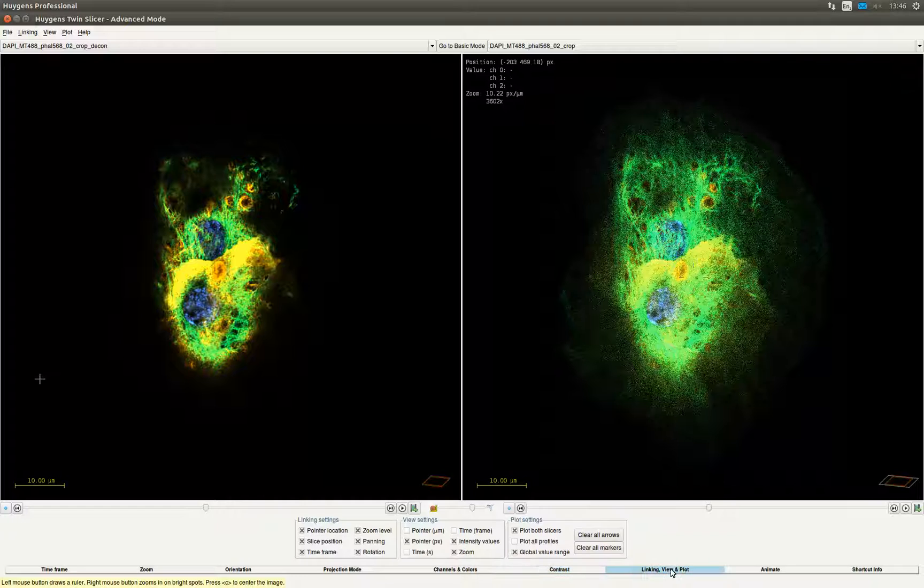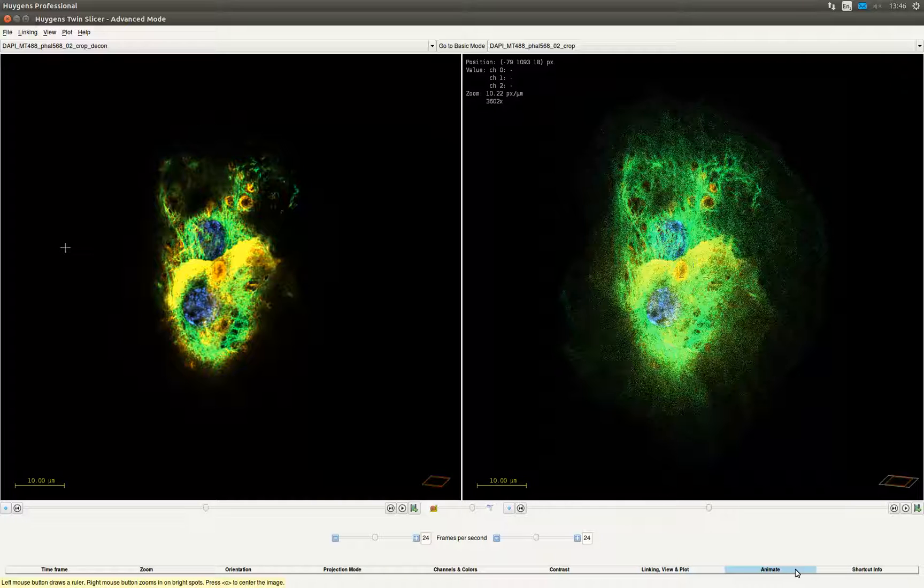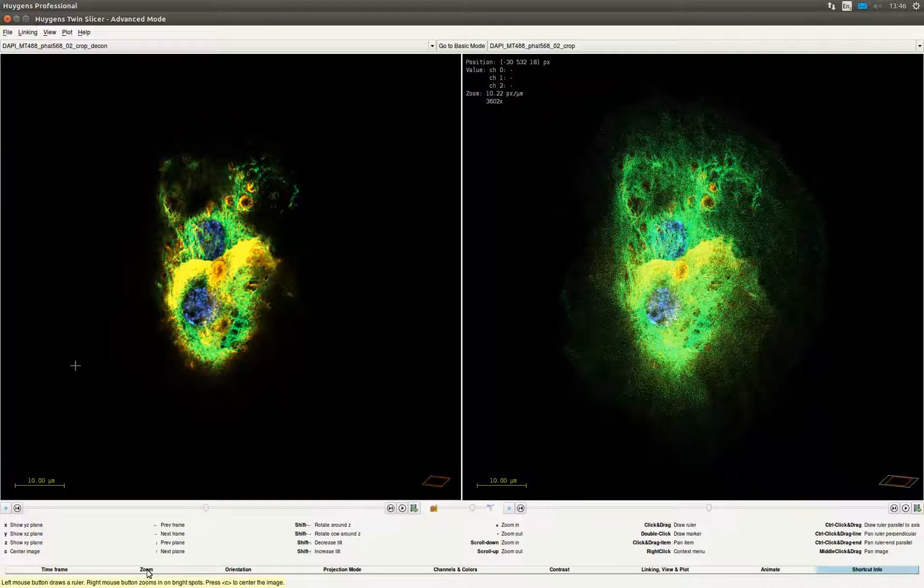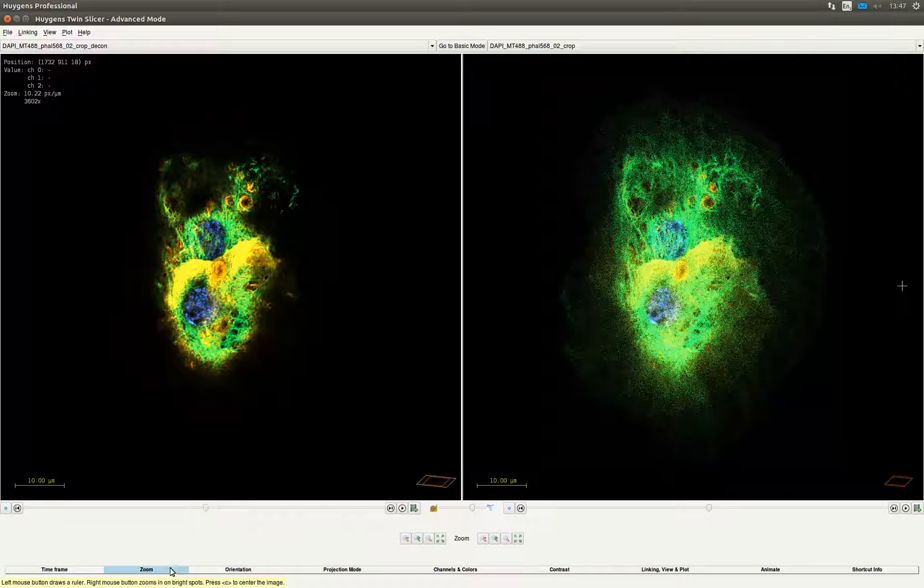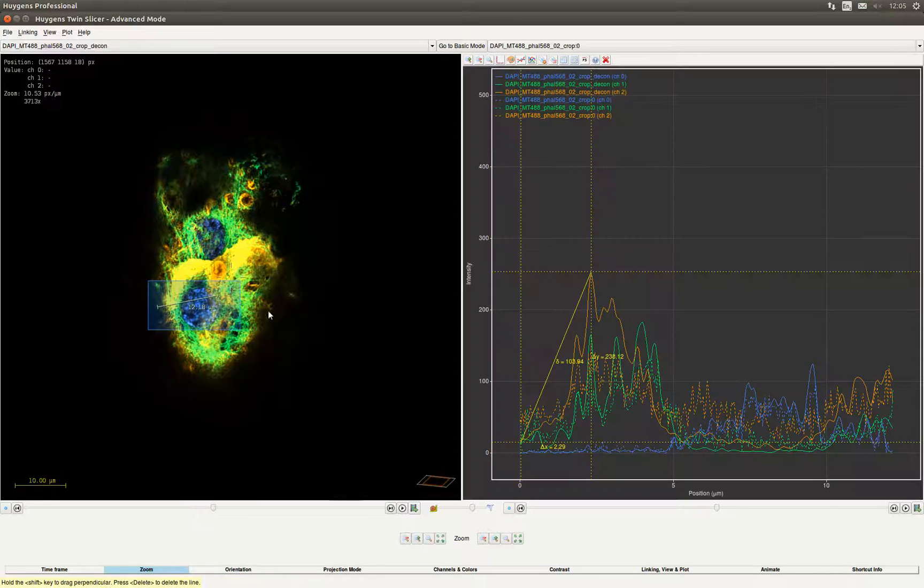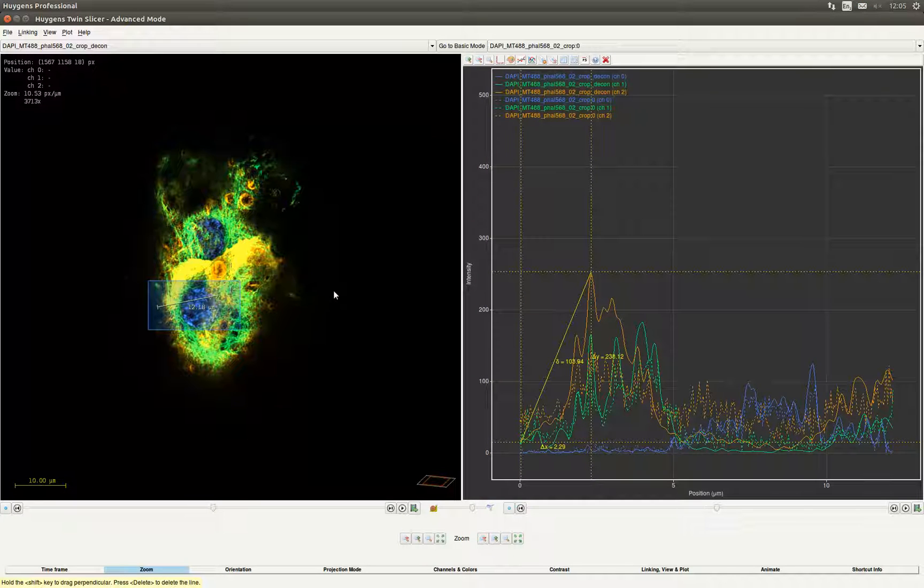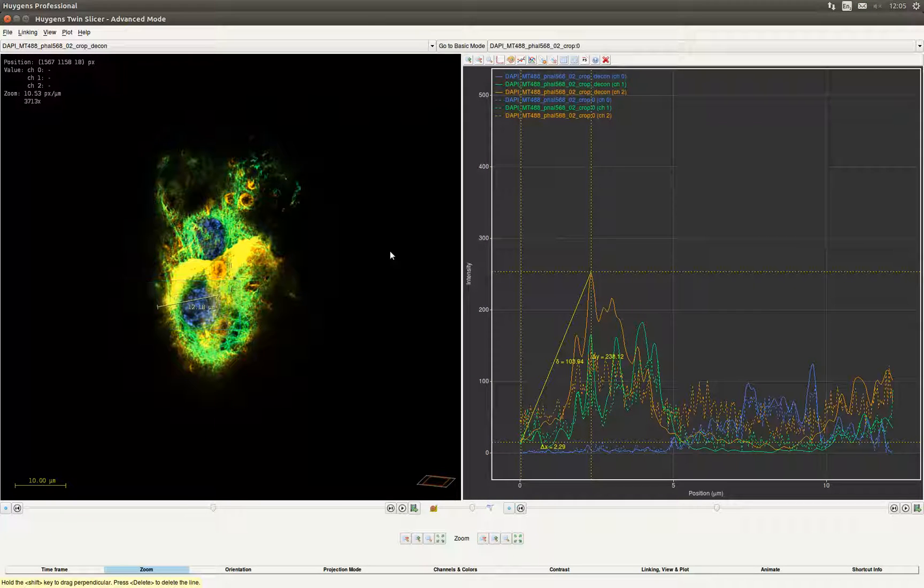In the linking, view and plot tab you can adjust settings for the linking between the two images as well as what values you want to view and plot settings. The animate tab can be used to adjust the frames per second in an animation. For more information on shortcut buttons you can take a look in the shortcut info tab. In the time frame tab you can move through the time frames in case your image has multiple time frames. And in the zoom tab you can zoom in and out on the images. You can also do measurements by dragging over the image. A graph will pop up showing the intensity of the channels along the line.